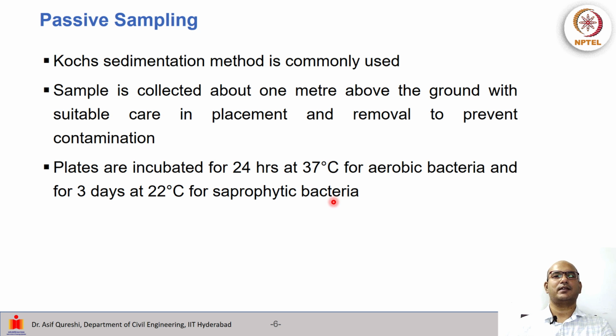Basically, we provide the ideal conditions for the growth of their colonies, because at the end of the day we want to know how many colony forming units are present. So we provide the correct conditions under which these bacteria can grow.